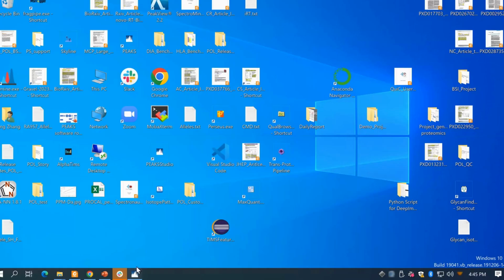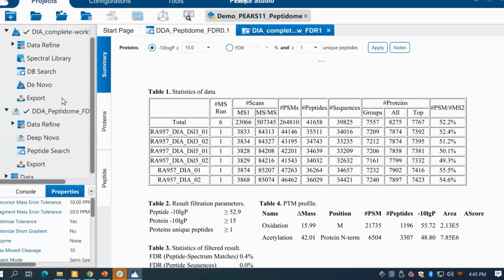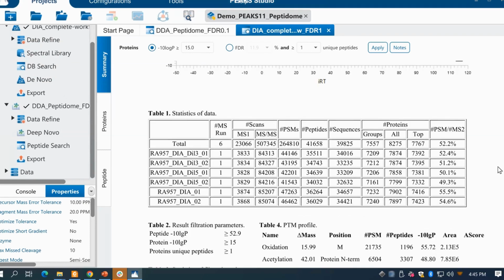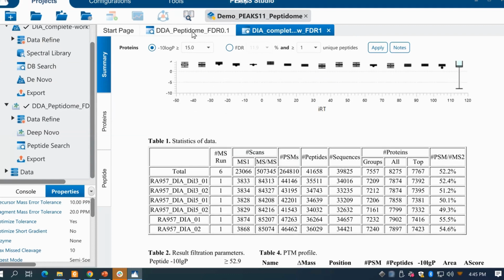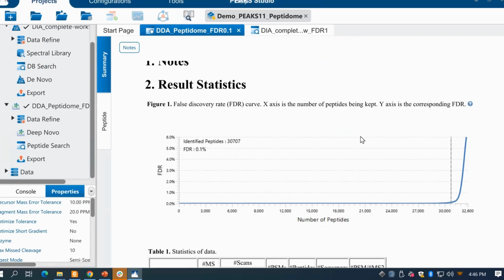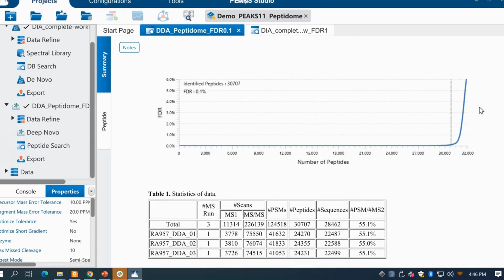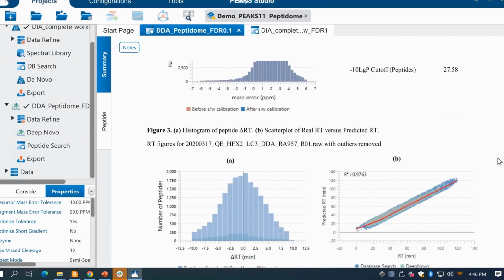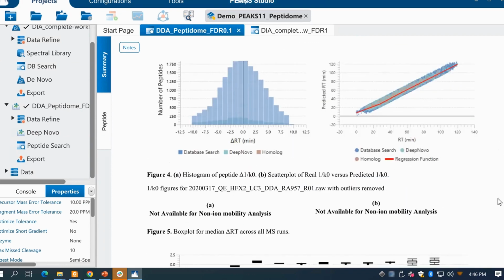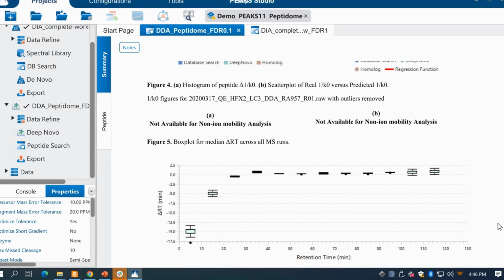And then we will show the workflow in the PEAKS Studio. Now in PEAKS Studio, most of the parts are similar, or exactly the same in Studio and online. So here, we just show some differences between PEAKS Online and the Studio. The summary page is exactly the same. We use the summary tables and some figures to show the results.